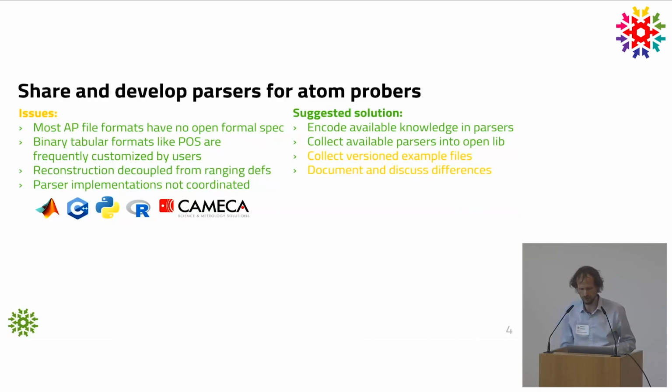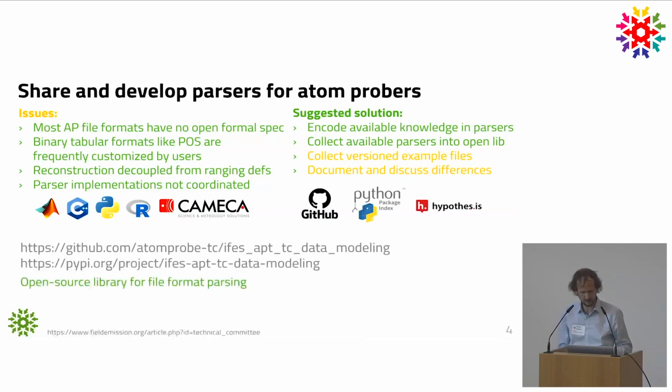And also what we've done, we collected example files of various versions in order to counter this challenge of no formal specification, so basically learn how the files are organized via somewhat of a reverse engineering. And for that, I just give the links here, because everything else, in particular if I give the talk, would be too quick, too technical. That is all in this open source domain. That's what we're using. It's an open source library for file format parsing. Everybody's welcome to approach. At the moment, we are focusing on Python. But there are also many parsers out there that other people could immediately put up there, and then with that help to coordinate their efforts better.